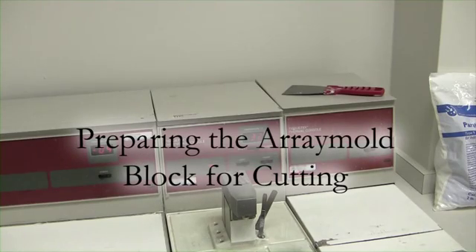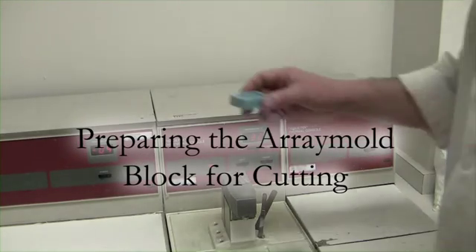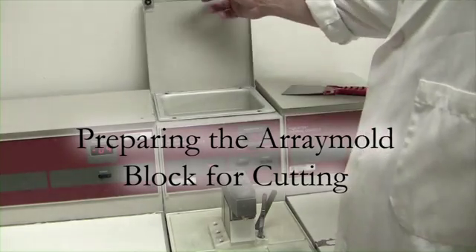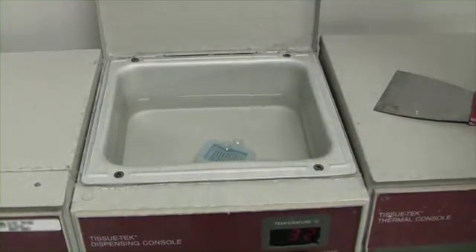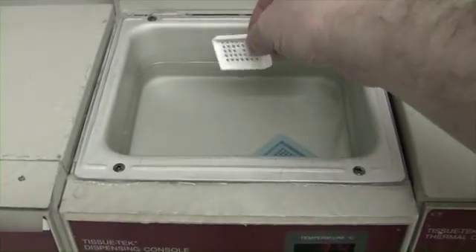Hi everyone, welcome to this special video on preparing an array block for cutting. Once the array mold is warmed in a paraffin bath, place it on an ice plate or ice tray and add a cassette.